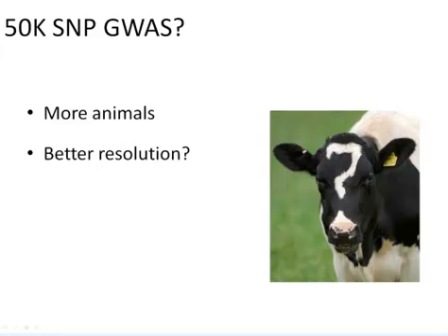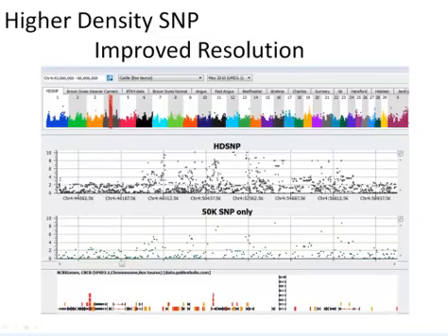To answer that, I went in and stripped out the high-density SNPs and only left the SNPs that are on the 50K panel. Luckily, all the 50K SNPs are represented on the HD chip, and so I went back and looked at just those 71 animals again and found that if you only use 50K SNPs, you actually get the same resolution as with the microsatellite markers. So you're back to about a 10 megabase region. The other problem is that your peak is actually moved to the side. With the high-density SNPs, we have a peak that's on the left side of the 10 megabase region. If you use all the 50K SNPs, it looks like your peak is more to the right.